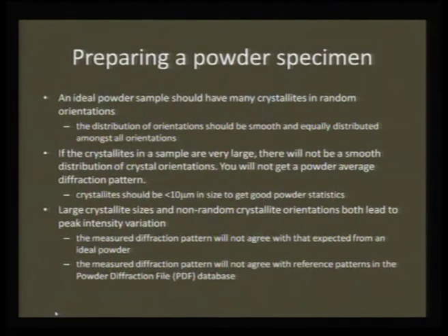Just one or two comments about sample preparation. It is not always the problem of the X-ray diffractometer when you do not see anything. Therefore, powder preparation is a very, very important protocol when you try to look for a very decent X-ray diffraction pattern. An ideal powder sample preparation means the different orientations should be smooth and equally distributed. If the crystallites in the sample are very large, there will not be a smooth distribution of crystals, therefore, there will be too much noise coming into the picture, and a larger crystallite size and non-random crystallites can also affect the peak intensity to a larger extent.